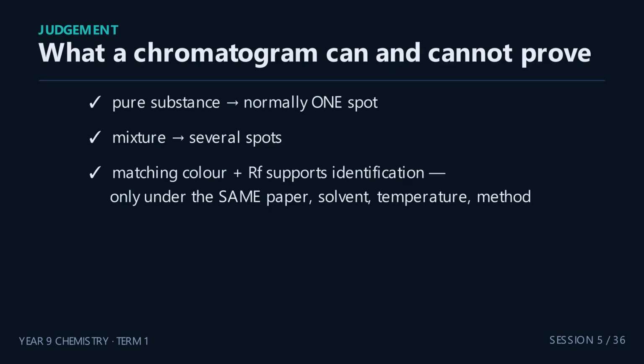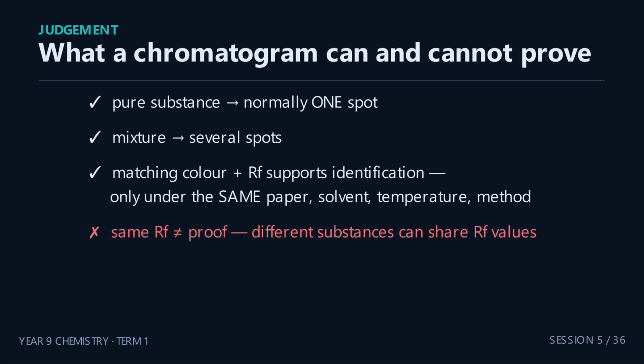And even then, be careful. 2 spots with the same RF are not proof of the same substance, because different substances can share similar RF values. Chromatography gives supporting evidence, not absolute proof.